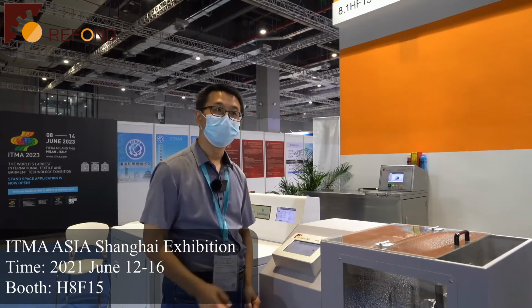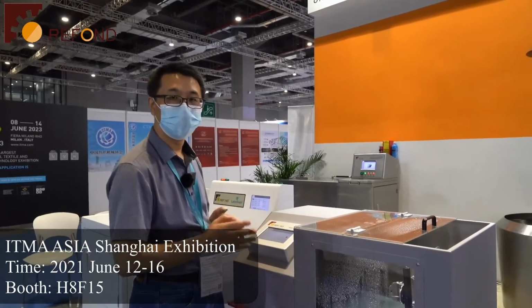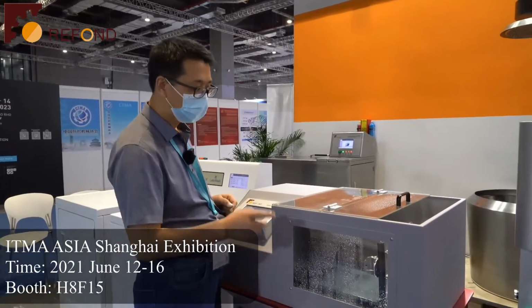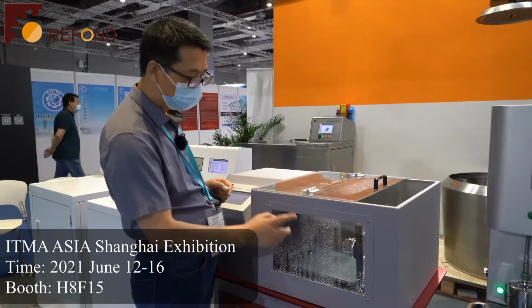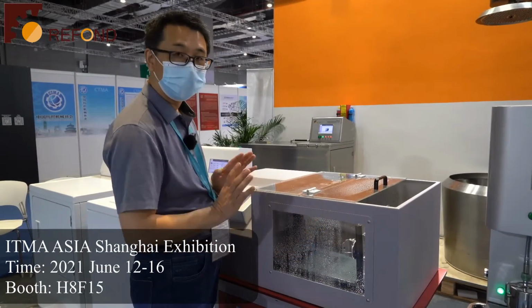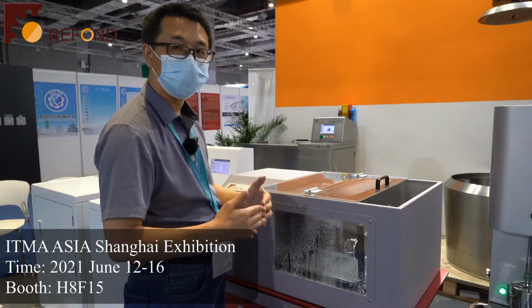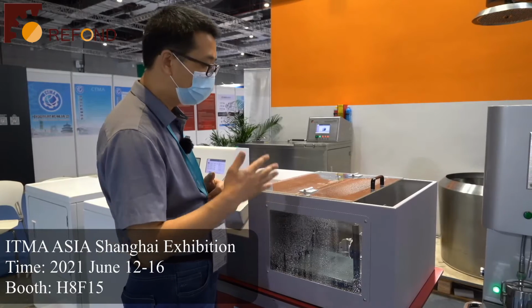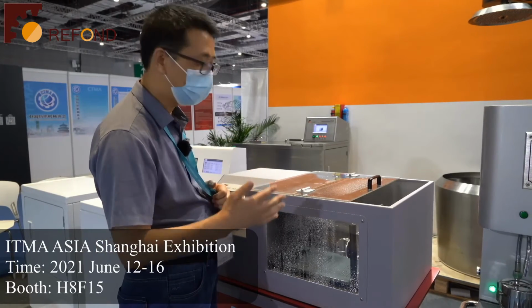Let me introduce our rain test to you. This is the rain test for AATCC 35. The function of the rain tester is to simulate the rain which impacts on the fabric and to assess how much water penetrates from the fabric into the backside.